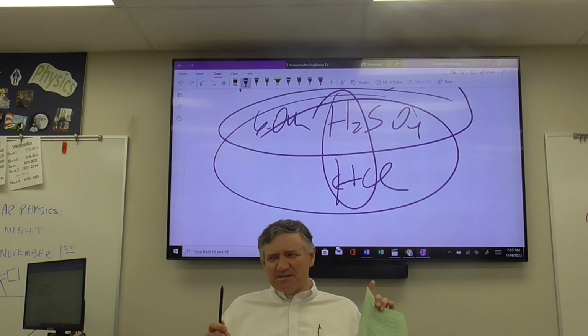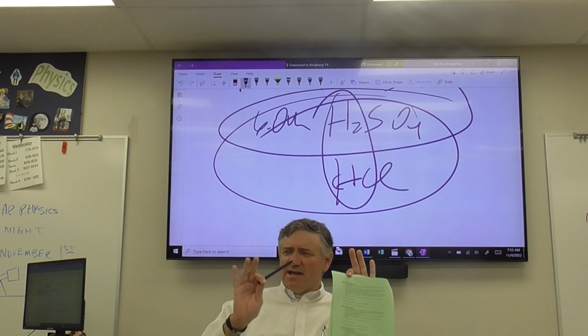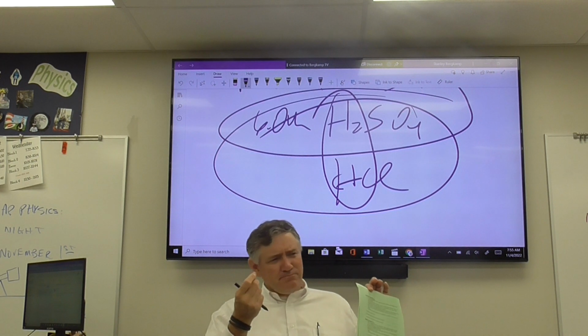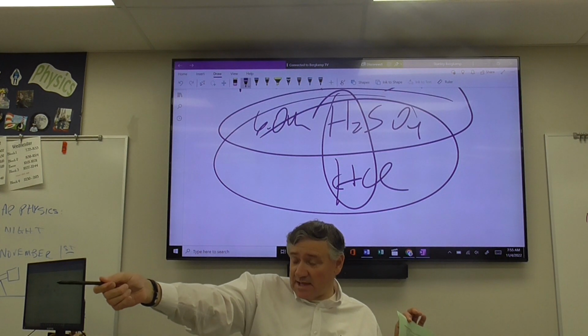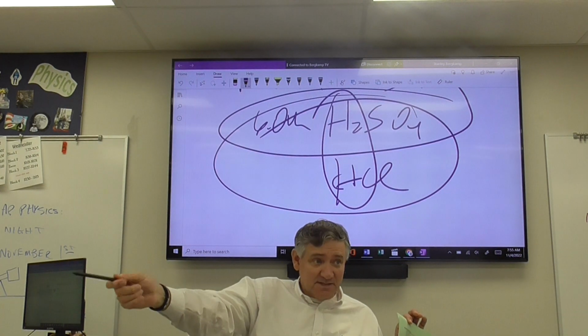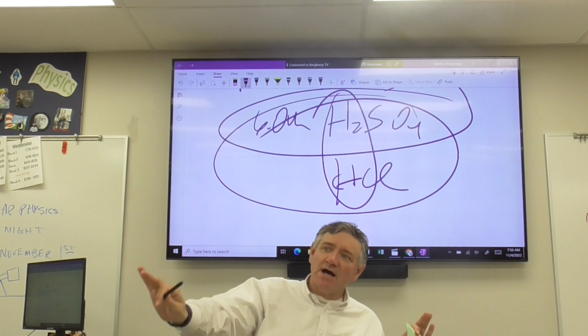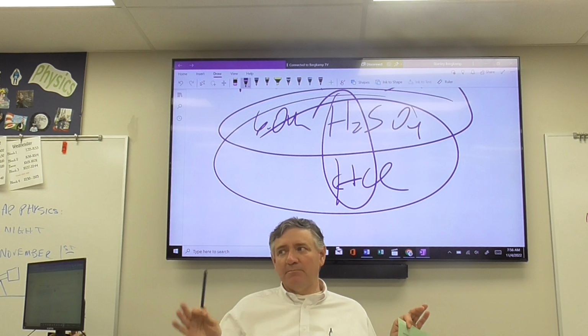This is also one that's a little bit sketchy, okay? So in an ideal world, when this gets done, it almost has a very faint, diluted cherry Kool-Aid look to it, okay? Almost like Addie's sweatshirt. That's what it's going to look like in a best case scenario. Sometimes it might be a little bit darker, sometimes it actually looks like mud brown, okay?